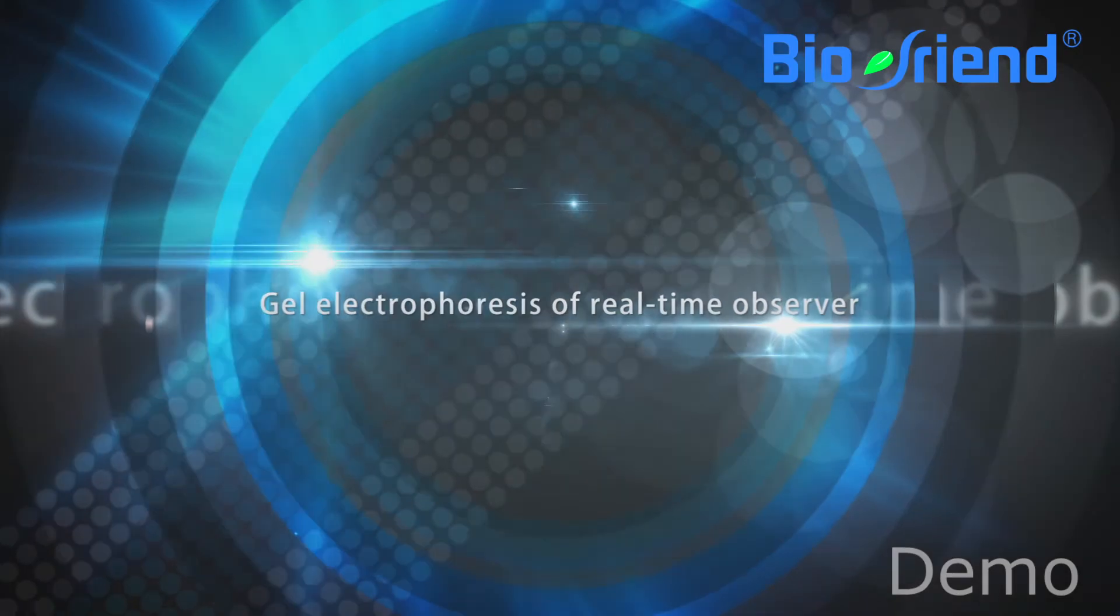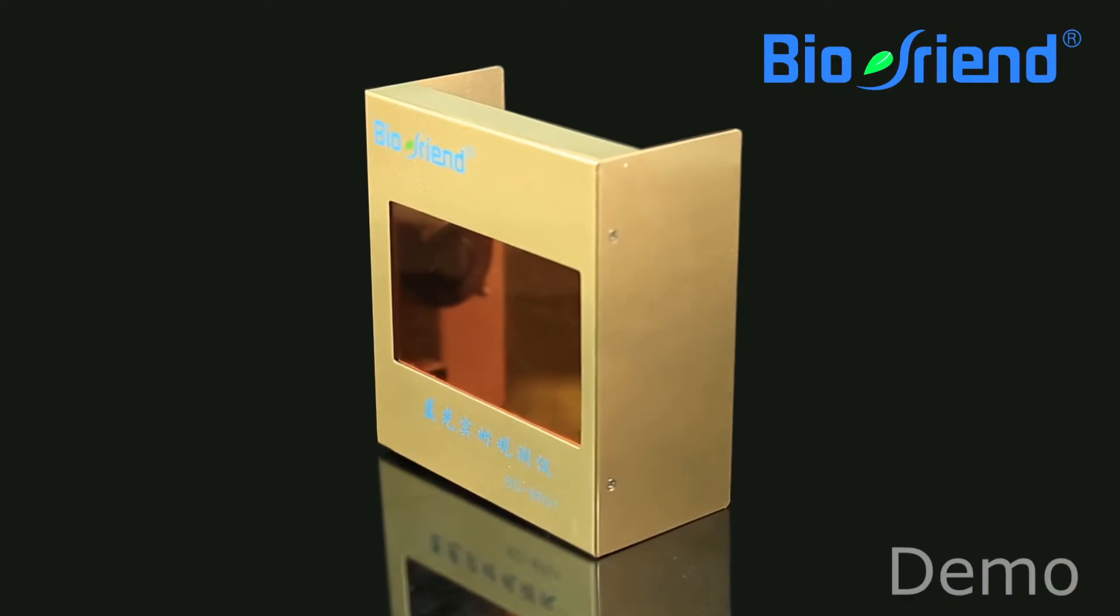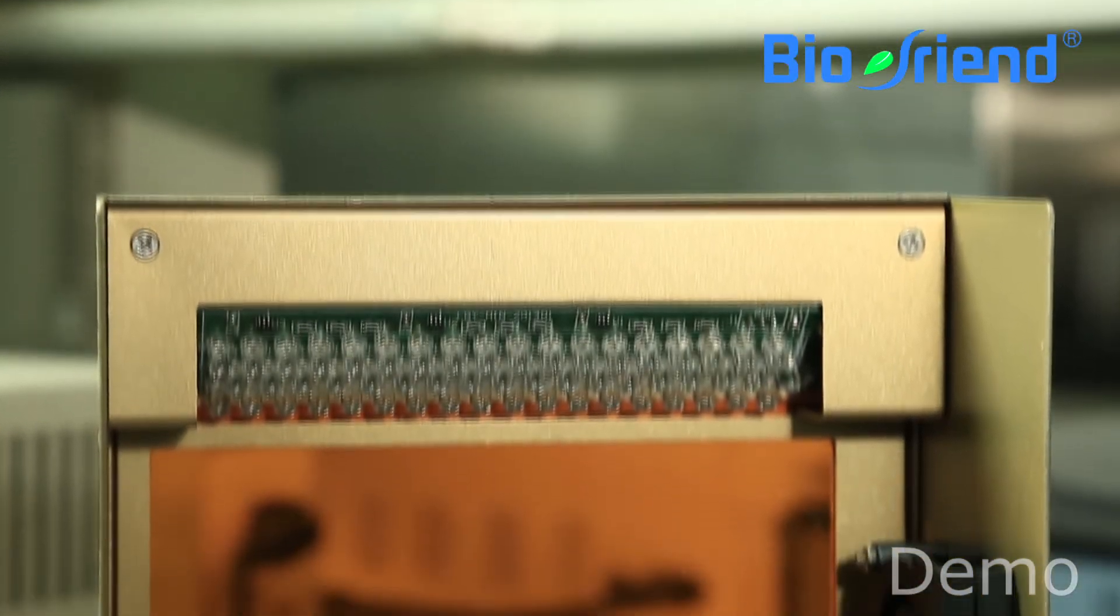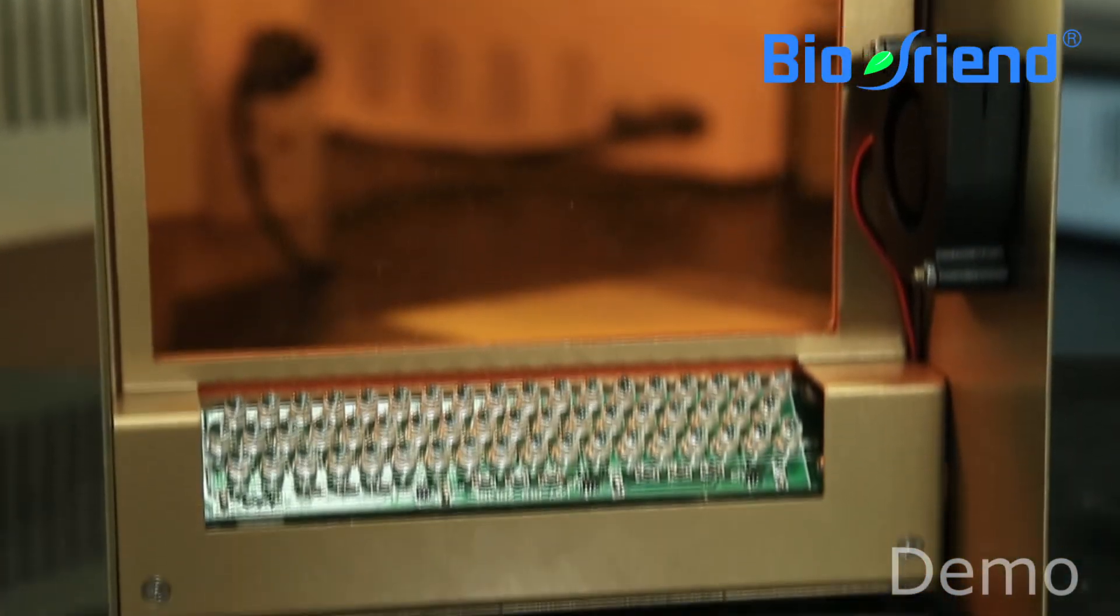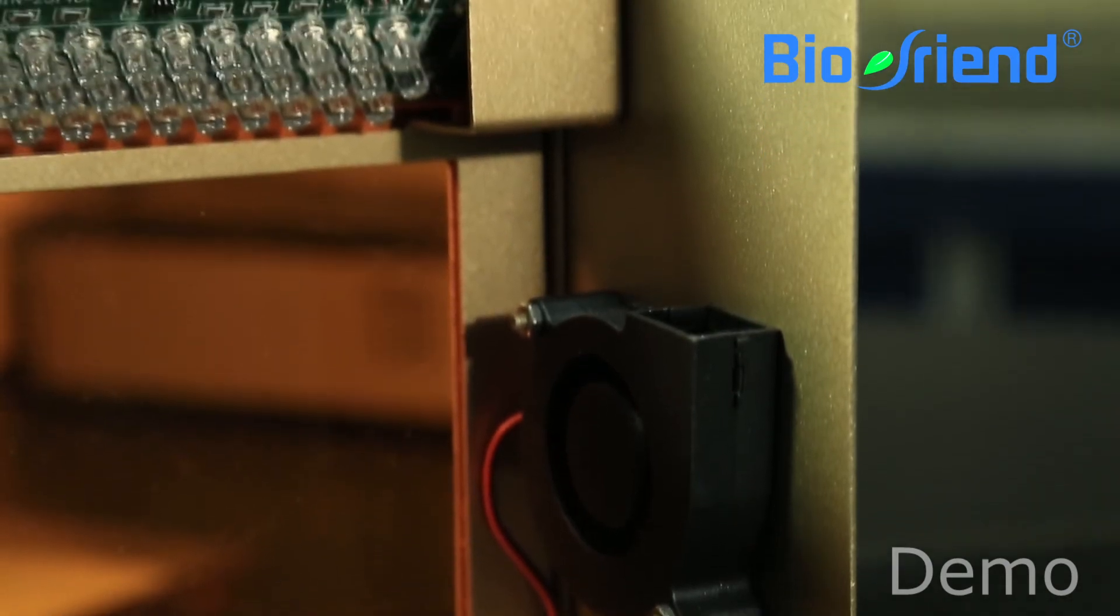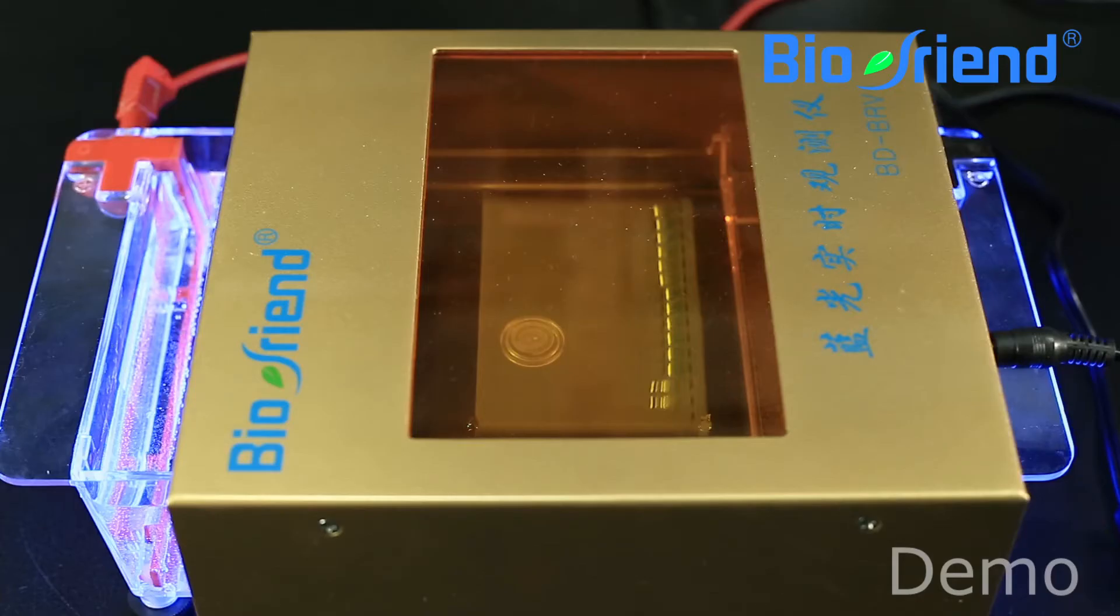Second, let me show you this BioFriend Real-Time Blue Light Observer. BioFriend Real-Time Blue Light Observer is equipped with blue light LEDs and an anti-fogging unit to allow for immediate visualization of DNA and RNA bands while running electrophoresis.